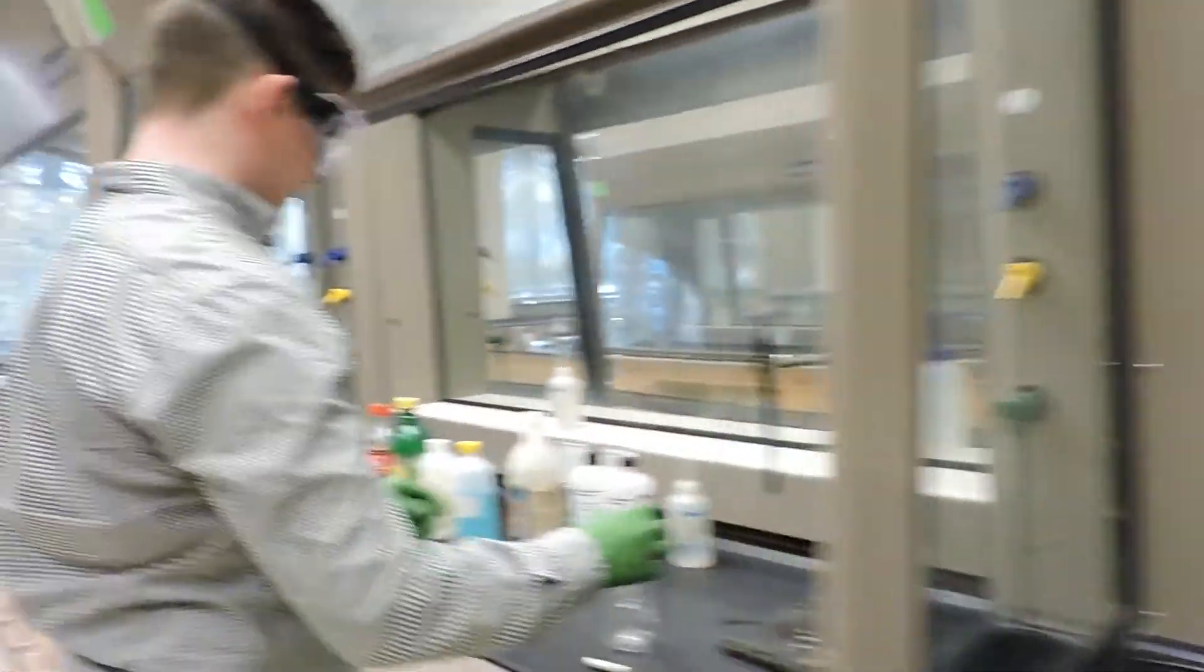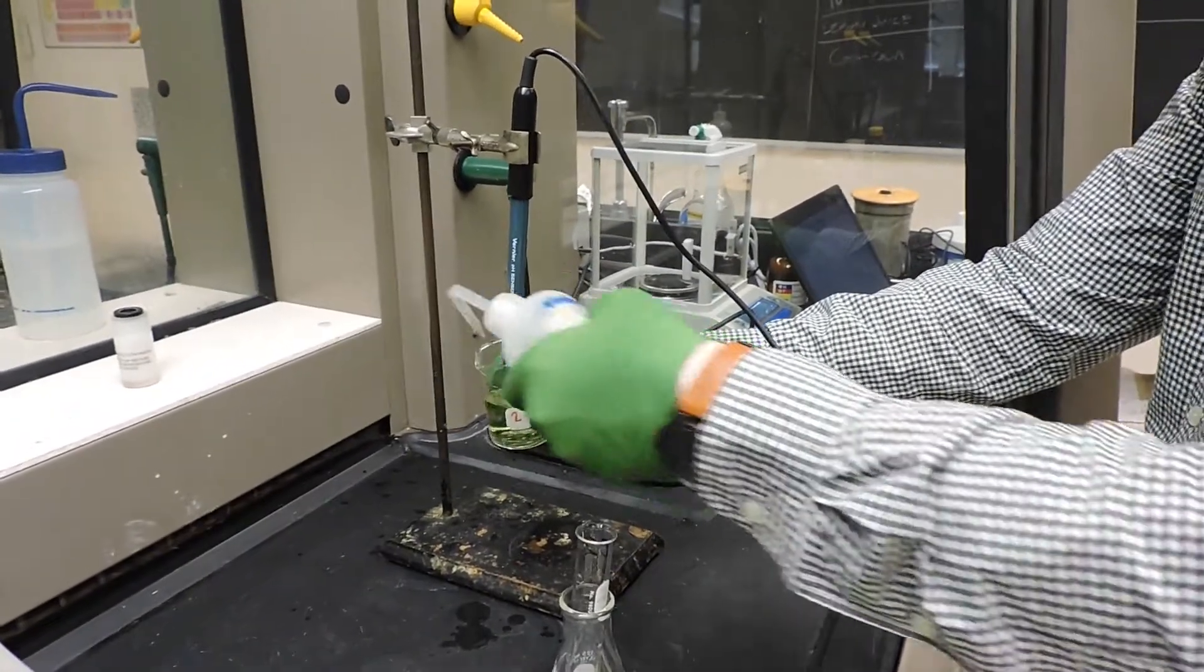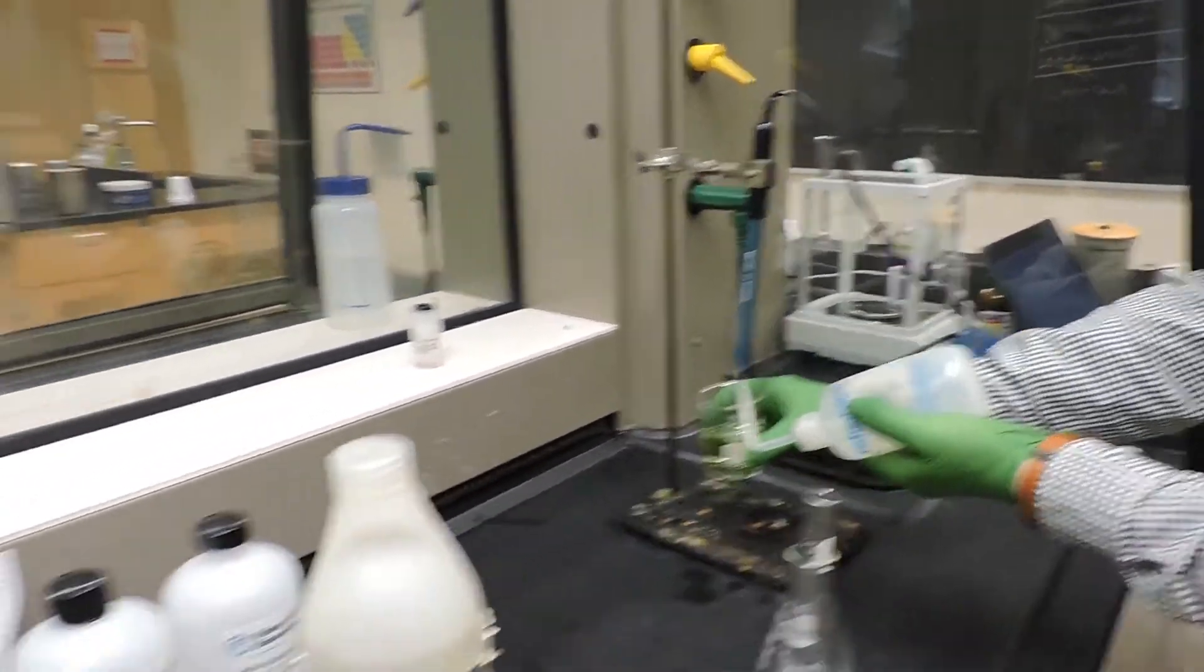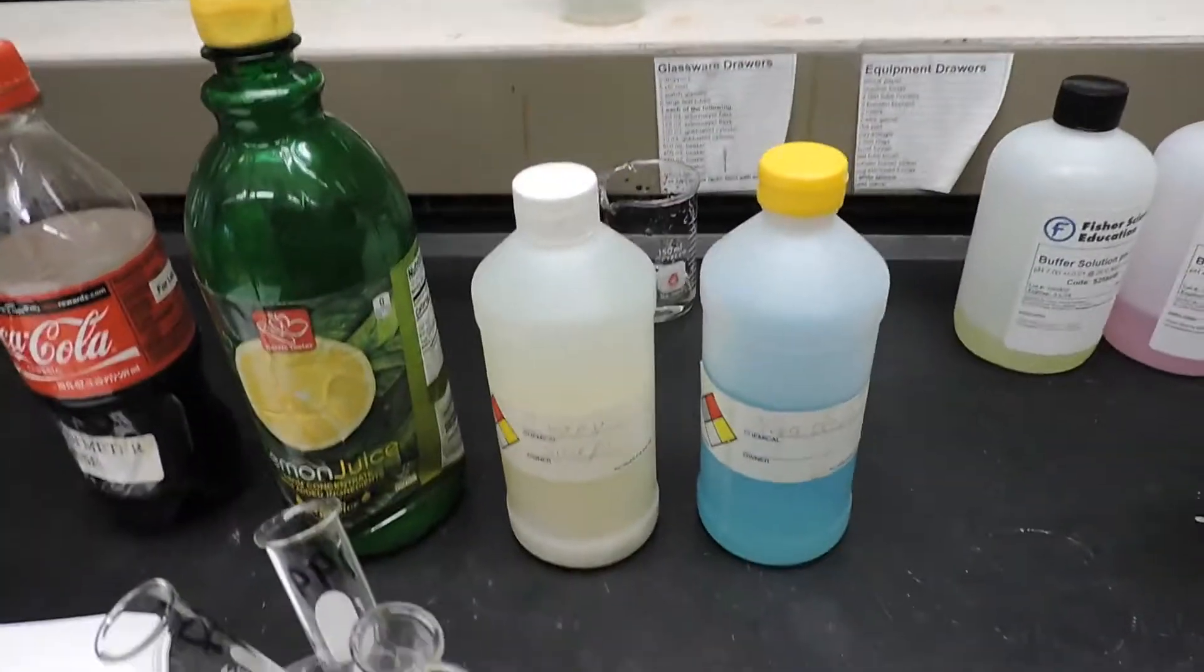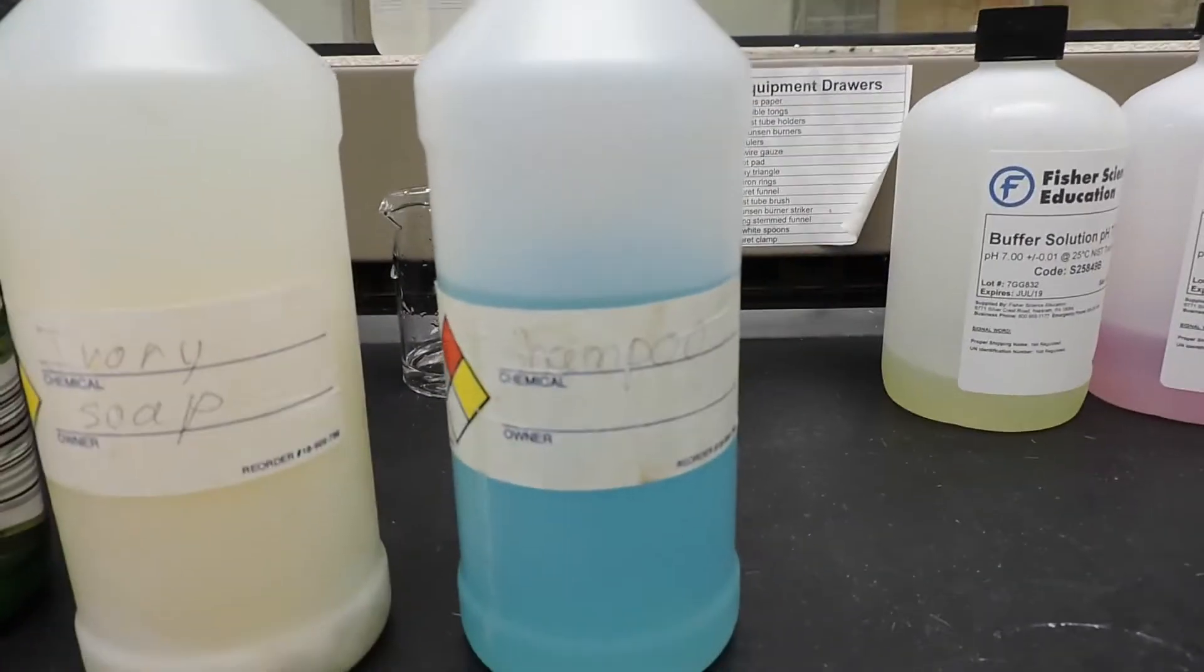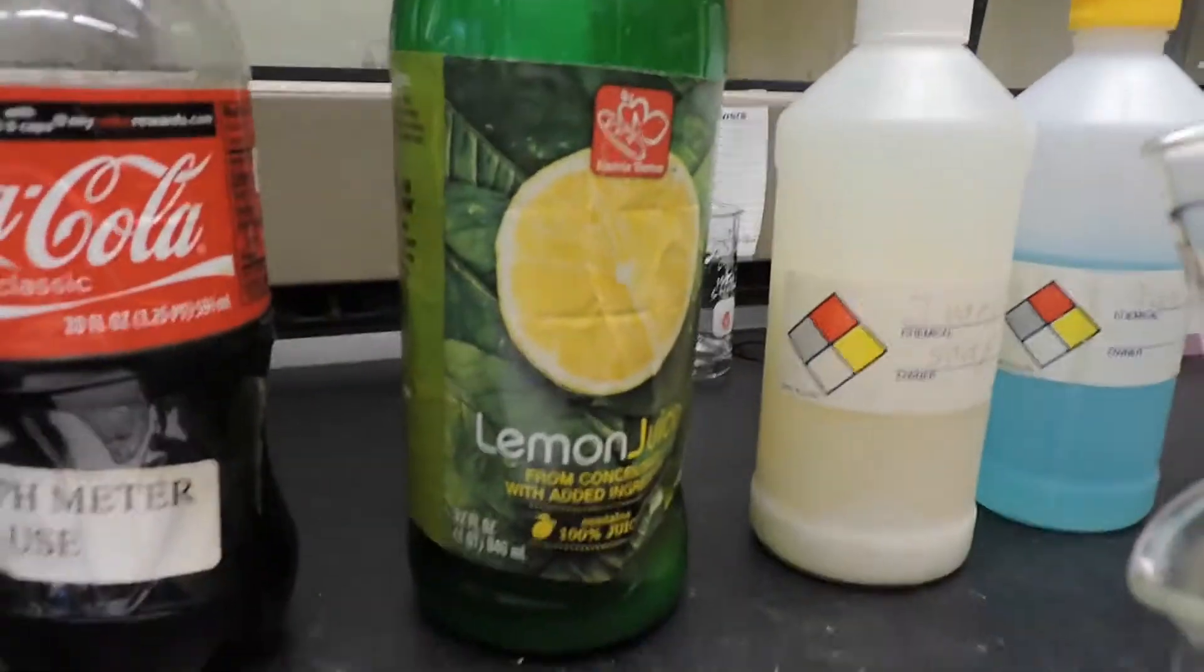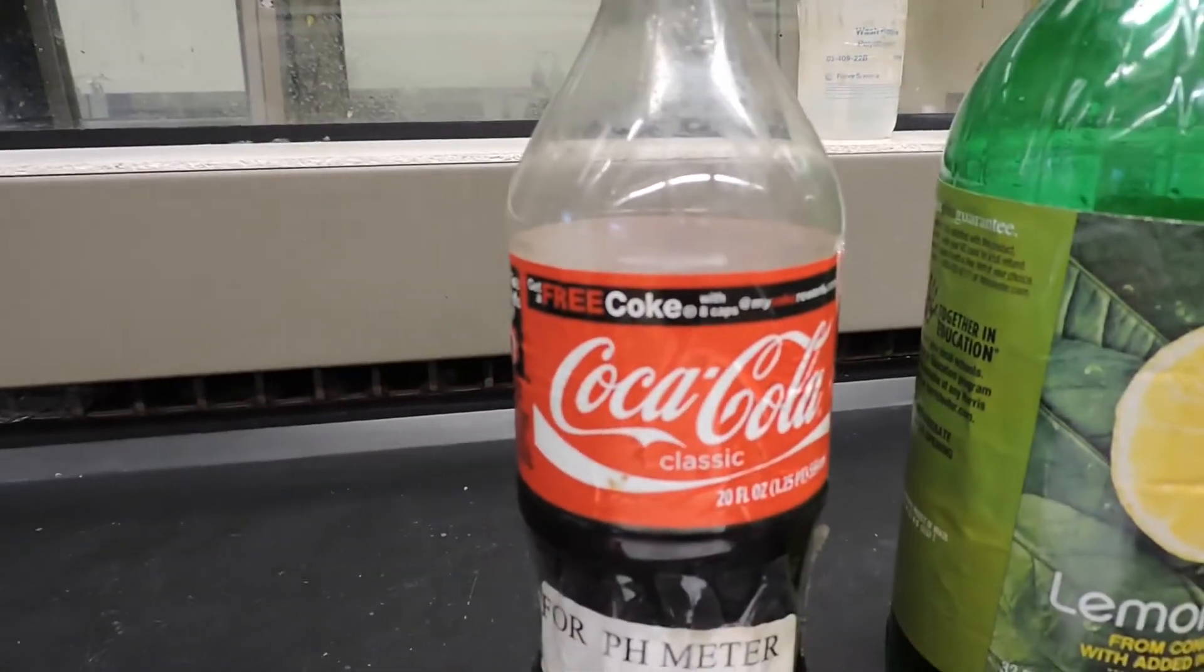So the next solution, well first we're going to rinse our probe because we don't want any leftover ammonia in there. And then we're going to measure the same way the pH of shampoo, ivory soap, lemon juice, and Coca-Cola.